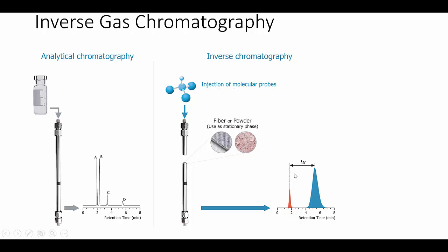So, by looking at the retention time, and correcting for other factors, like vapour pressure, mass, etc., you can get a measure of the affinity of a probe for the polymer, excipient, or whatever. And we'll show that we can take those calculated affinities and estimate the HSP of the probe material. Let's go straight to the app.